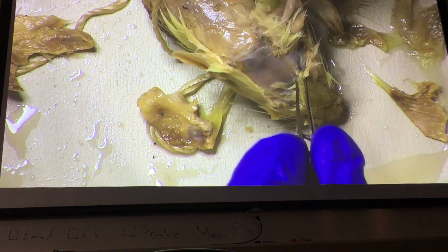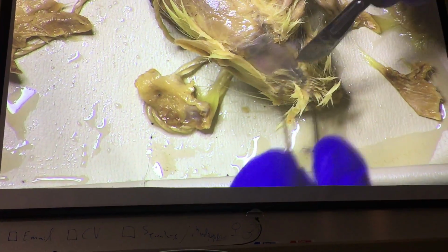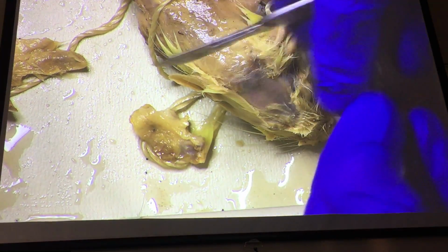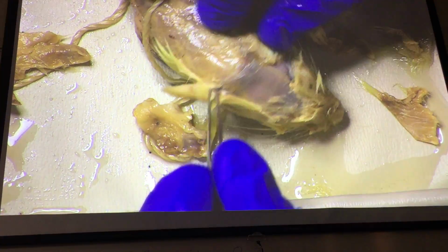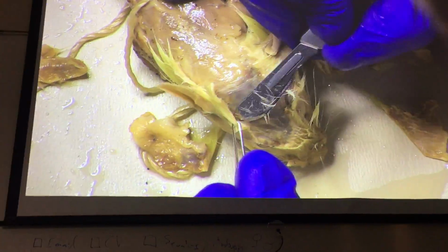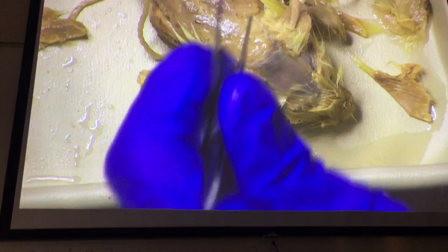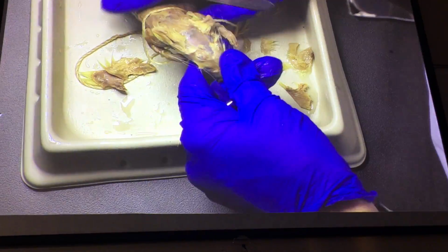And they do have muscles of facial expression. You don't think of rats as having very expressive faces. They actually do have some facial expressions. And they have to have something, otherwise there'd be nothing for primates to have evolved from, right? Mammals had to have, in general, muscles of facial expression for our group to have such well-developed muscles.